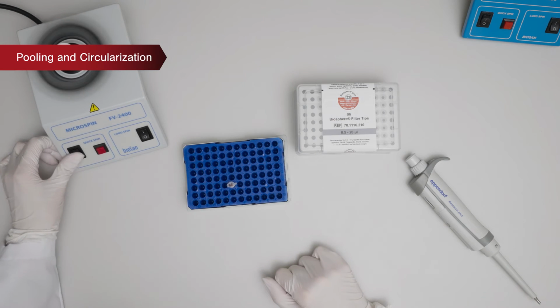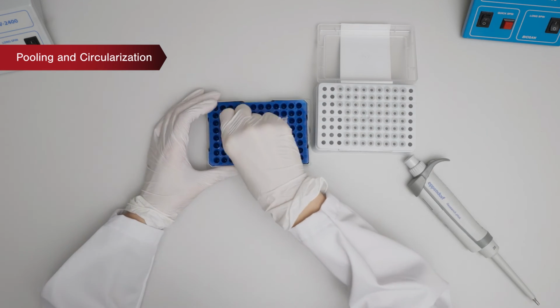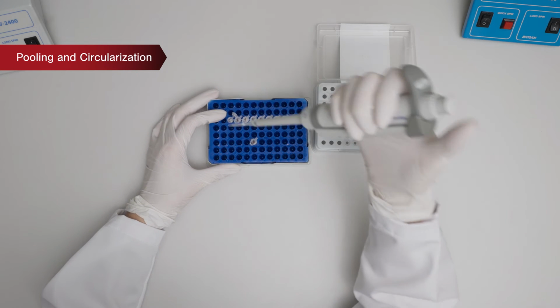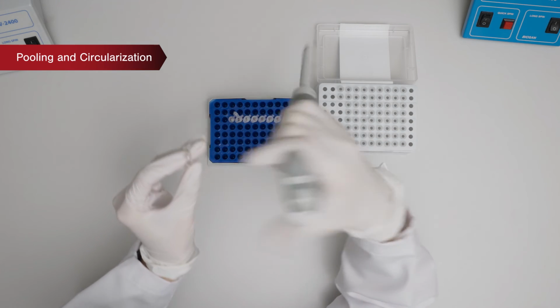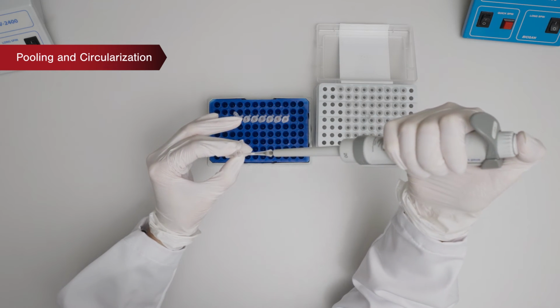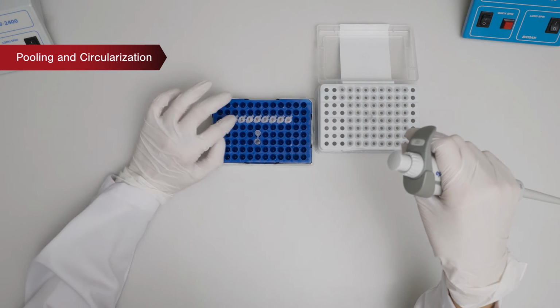If we need to sequence more than one sample per lane, we must pool the samples together. To obtain the necessary volume for pooling, we need to do the same calculations for each sample separately, and afterwards divide the final volume with the number of samples that are planned to be sequenced on one lane.